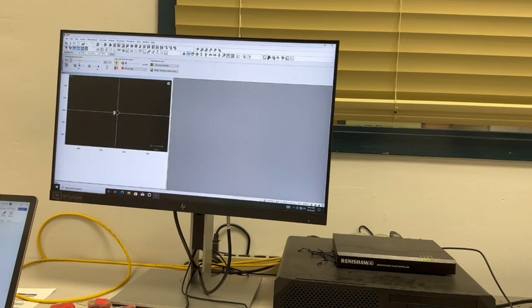As you can see here, the laser is not in the crosshairs. It is slightly to the left. If the laser is not in the crosshairs, then an auto align must be done. However, the auto align should only be performed by a representative from the Prasad Lab for Materials Research.